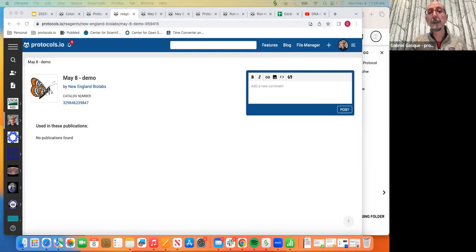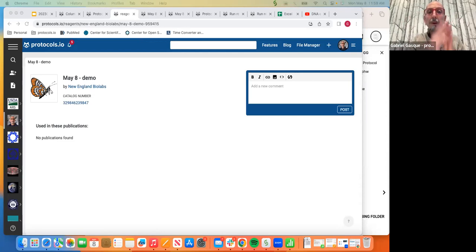There are other questions in the Q&A. Oh no, these are the questions. Anything else? Oh, sorry, you're asking another question which I missed. So can I share only a folder created in my workspace with collaborators? Yes, well, you cannot share a folder. I think you can share a protocol.